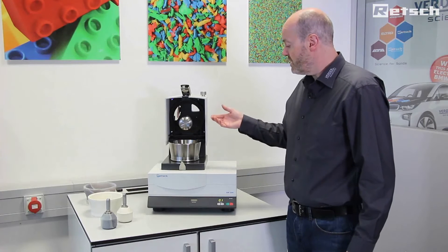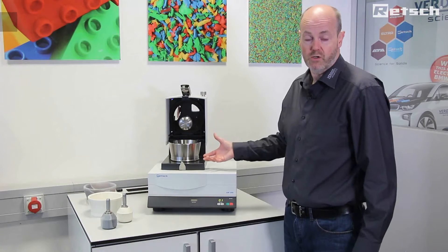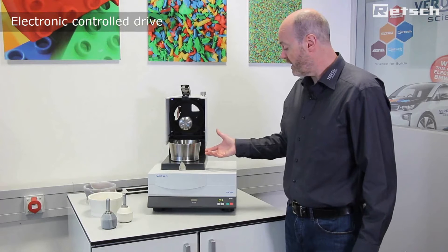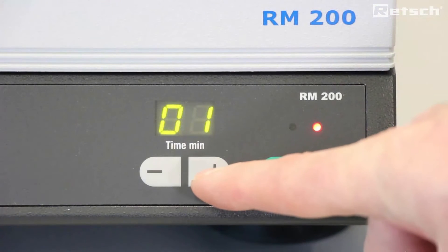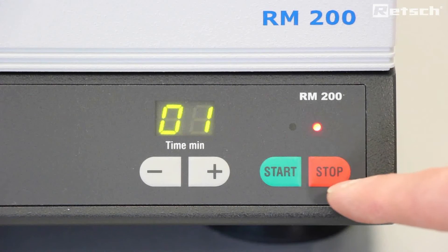The instrument is connected to a strong drive with electronic control. Here we can see that there is an electronic timer in minutes, along with start and stop controls.